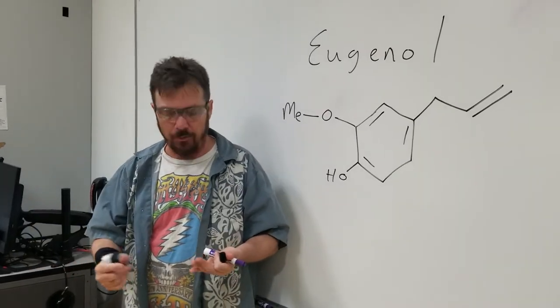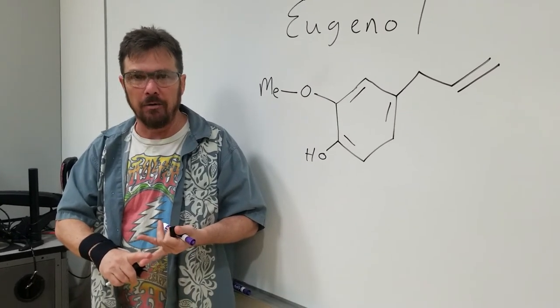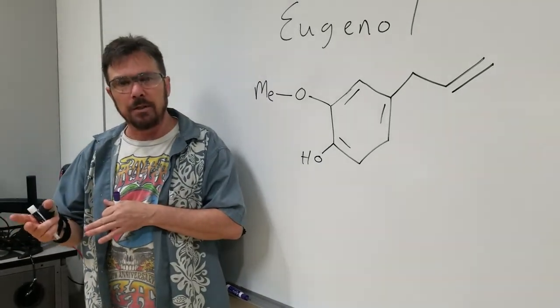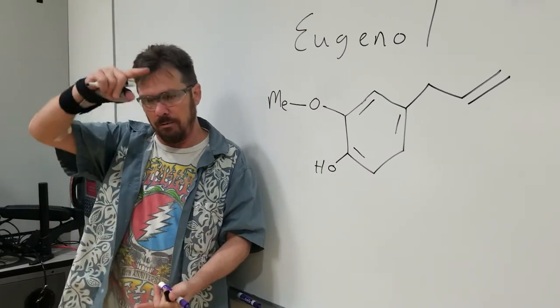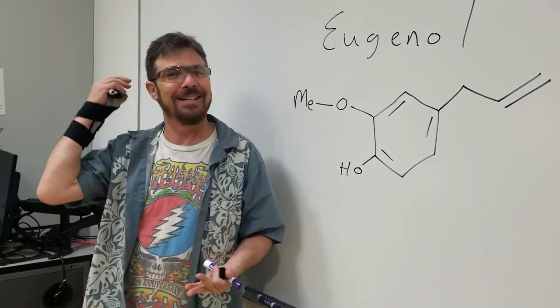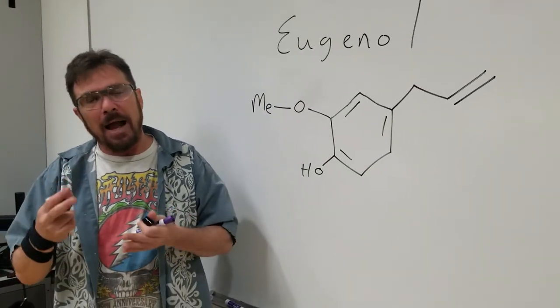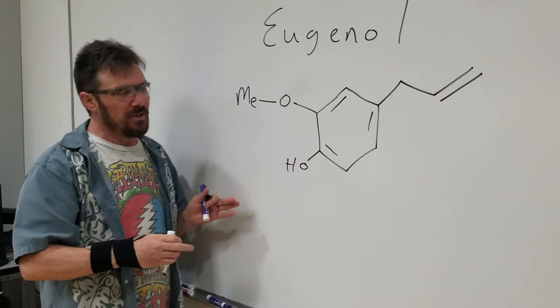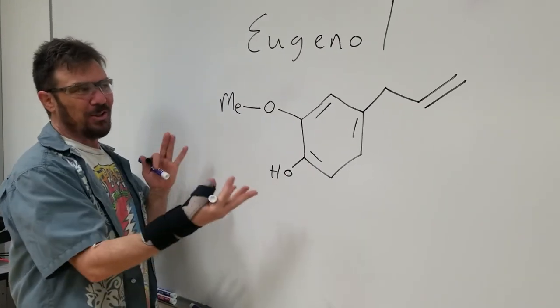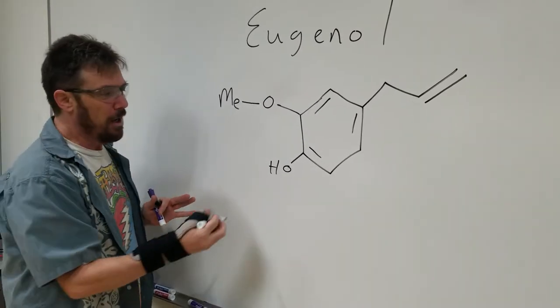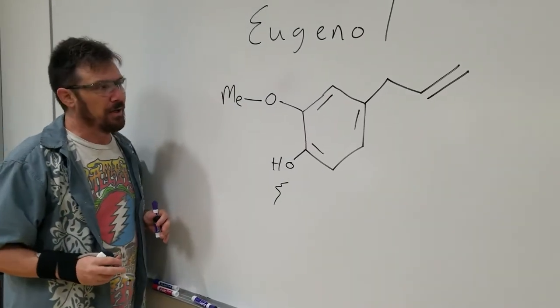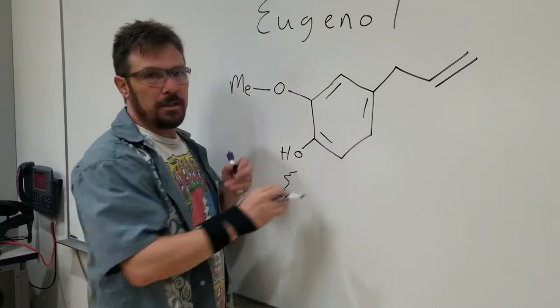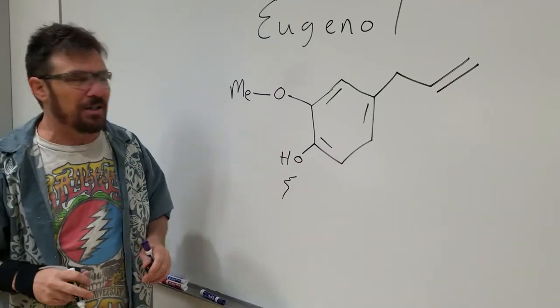We're going to have two techniques to use today: distillation, and then extraction. When we taught distillation before, we did the short path and then fractional distillation with a packed column. We used the packed column because we wanted more theoretical plates to separate two compounds. Now, like dissolves like — is eugenol polar or non-polar? The phenol helps water solubility, but the rest of the molecule is all hydrocarbon, non-polar, and that really dominates the solubility. So this compound isn't very soluble in water.